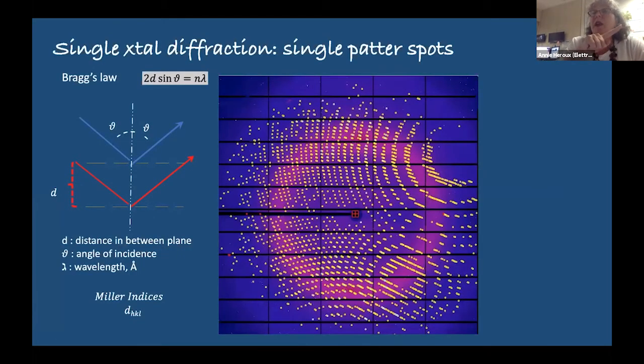Okay, so now let's get back. I talked about the data collection. We rotate the sample, usually 1 degree, 0.5 degree, a little bit, and we expose. And this is what we get for the diffraction pattern. You will see different diffraction patterns when Jasper talks after me. In our case, you heard Heinz talking about the SAXS, and he presented the Bragg law. And you can see the spacing that you're looking at.